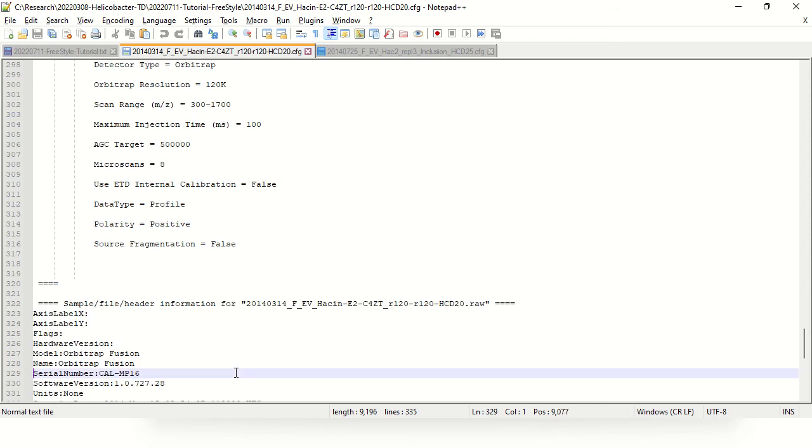So if you are looking at data in the wild, we do not frequently see all of that material provided as part of the file name. So we need to look at the instrument methods to deduce that, if that is relevant to how we're going to do our data analysis.